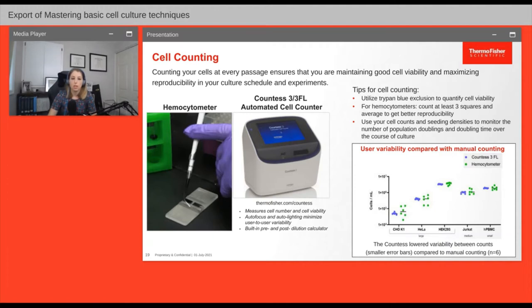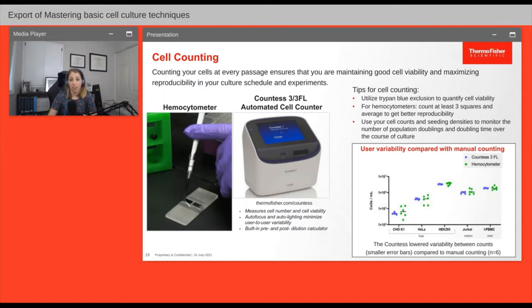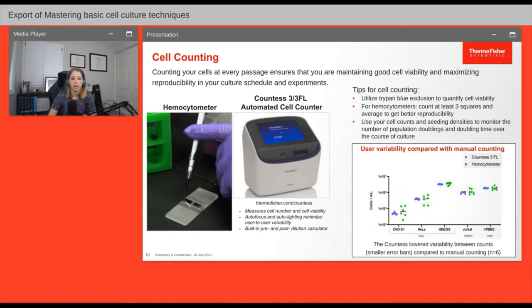That same counting process is done automatically by the Countess Automated Cell Counter. For both the hemocytometer and the Countess, I recommend diluting your cell solution one-to-one with trypan blue — accounting for that dilution — to check cell viability. If trypan blue gets inside a cell, that cell is dead and should be excluded when calculating how many cells to seed into your new vessel. Using a hemocytometer will work for maintaining cultures, but if you need high reproducibility between counts or between researchers, consider the Countess Automated Cell Counter, as shown by the reduction in user-to-user variability in the data.